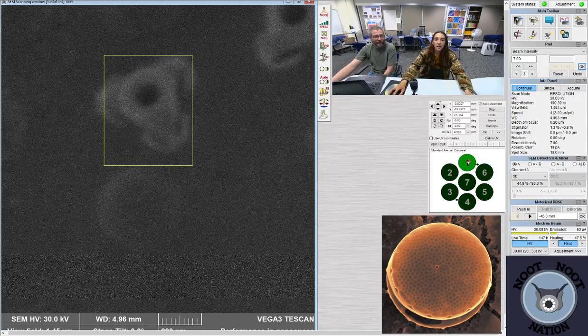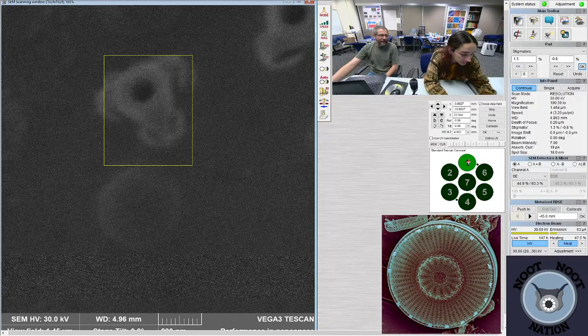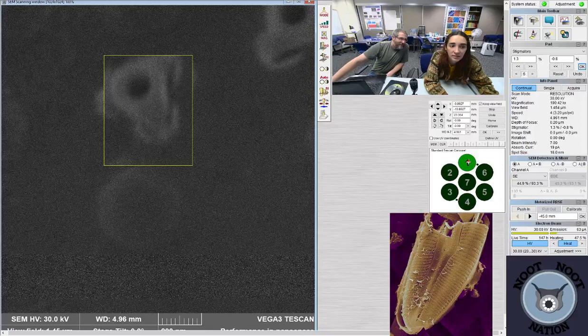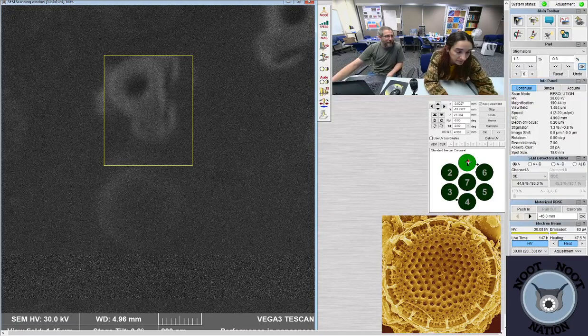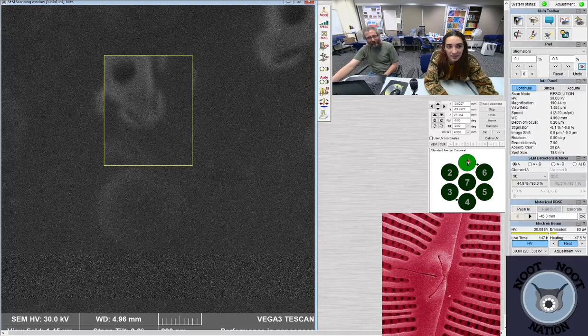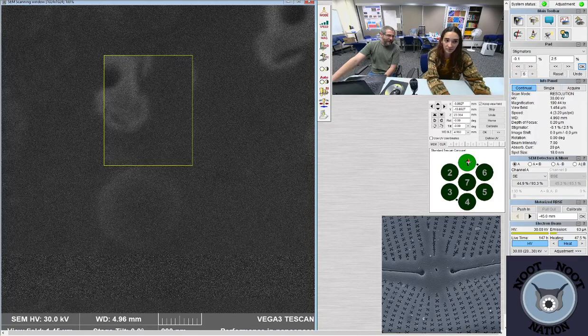This one, right? Stigmation, yes. And then it's the knobs. Try to make sure the focus is as good as you can get it first, and then somewhere in there. Around there, yes. And then play with the stigmation knobs until it looks like the whole thing's in focus. Just do one at a time. It was looking good for a second there. Yeah, it's pretty good. I think good. Around there, right? Did you do both or just one? Just one. Now I'll do the other one and see if you can get it to be even tighter. Worse? Better? Better. There? Yeah.